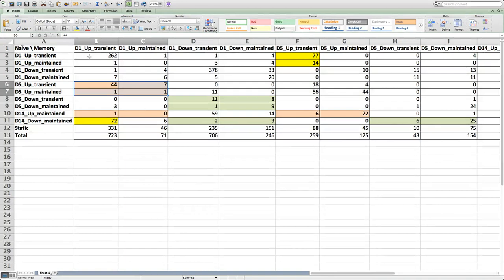So I just got the FDR values for each of those 6 contrasts, and then the 6 for naive and the 6 for memory. And I did a global FDR adjustment. And then I just picked the ones that were significant, and then I got the sign of the fold change as well for up or down. And I wrote out the code to categorize each gene, and then I used the table function in R to generate this.